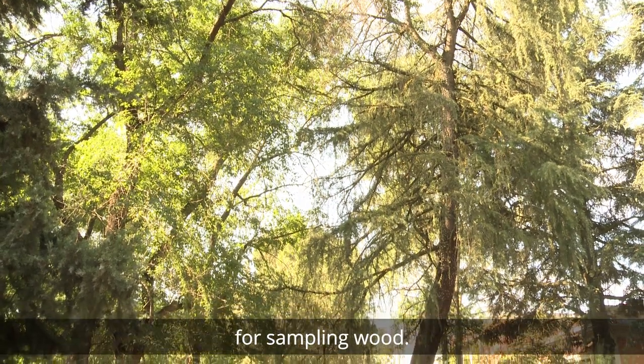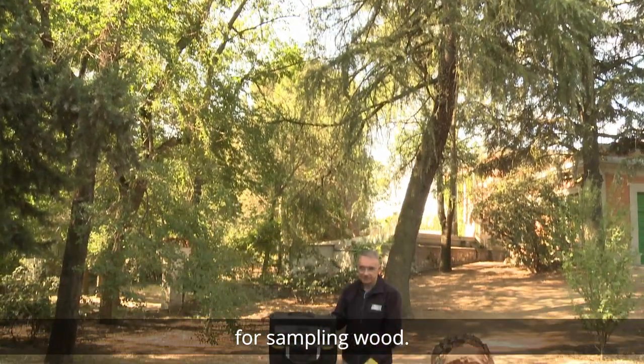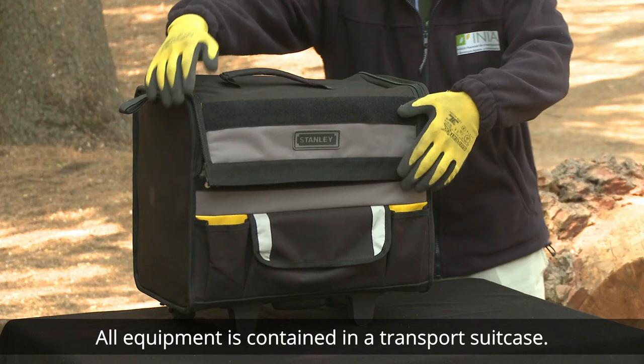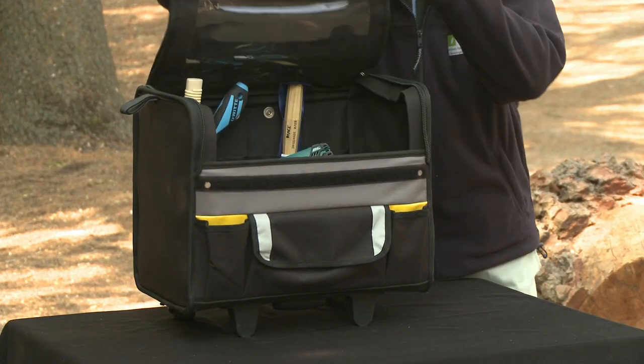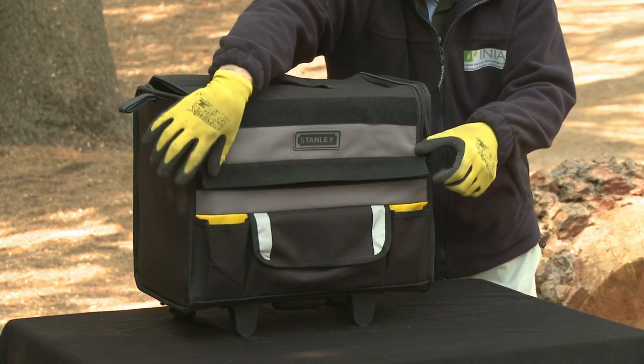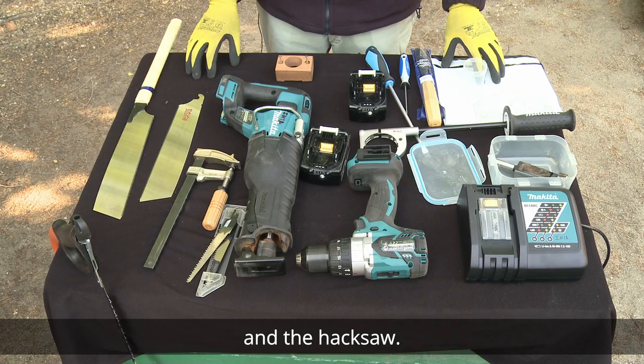Welcome to this explanation about the equipment for sampling wood. All equipment is contained in a transport suitcase. We will start with the manual tools that will be used on boards. We have two tools: the Japanese saw and the hacksaw.